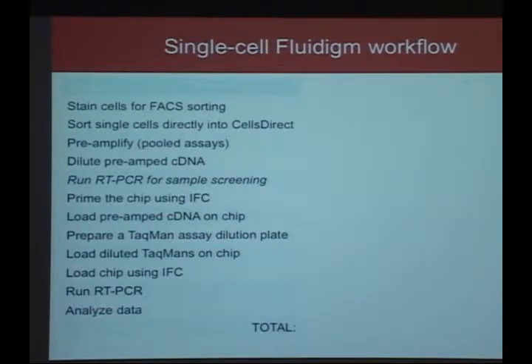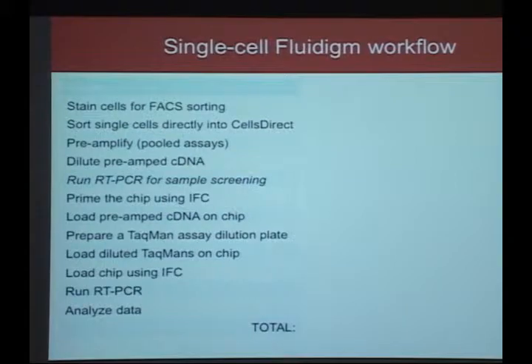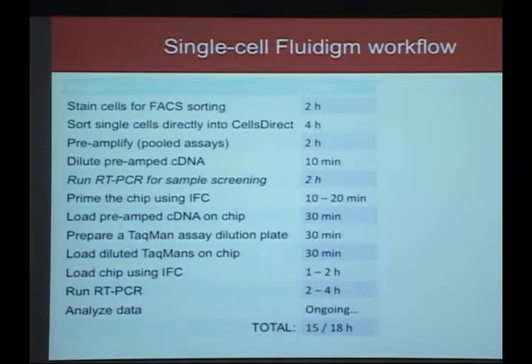But I thought maybe you were meaning just to array out on a plate the primer probe sets, keeping it with several plates. I think for the short term that would be absolutely fine. I don't know how long though. I probably wouldn't want to freeze and thaw that kind of mixture multiple times. How do you, go ahead.